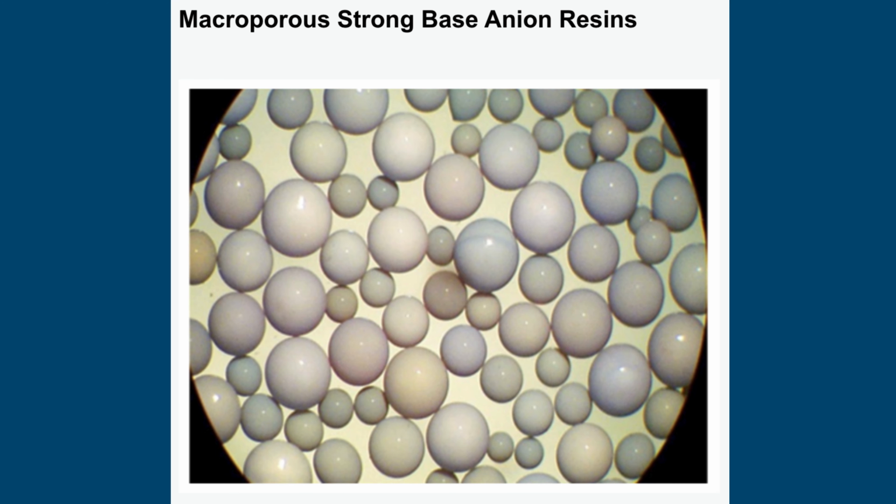These resin beads are best described as like a Swiss cheese. The holes or pores are produced by introducing a porogen, which gives the resin other improved characteristics for certain applications. Typical resin particles are on the order of 300 to 1,200 micrometers, while other commercial formats can be substantially smaller for analytical HPLC applications.